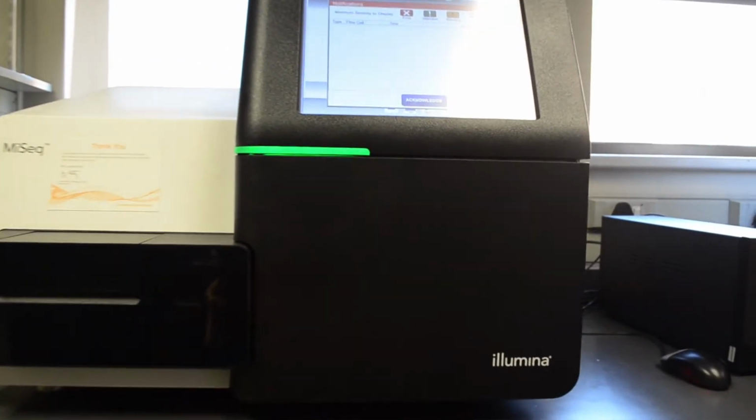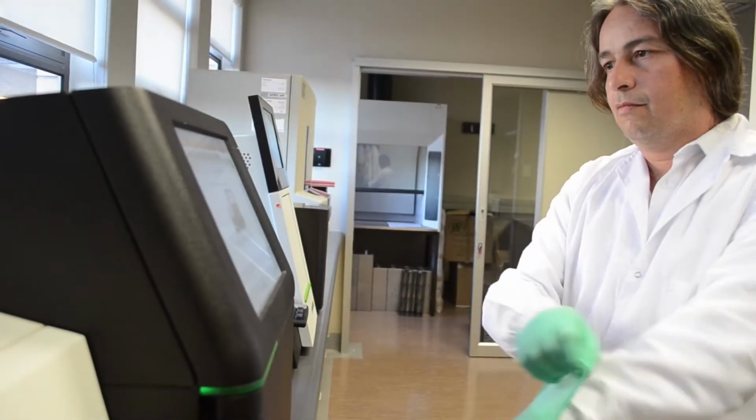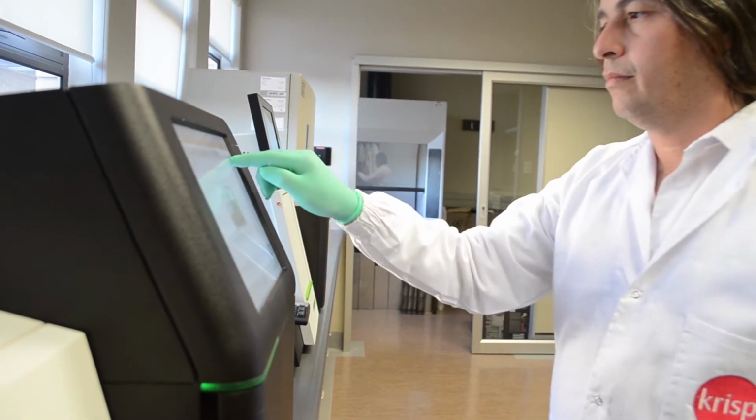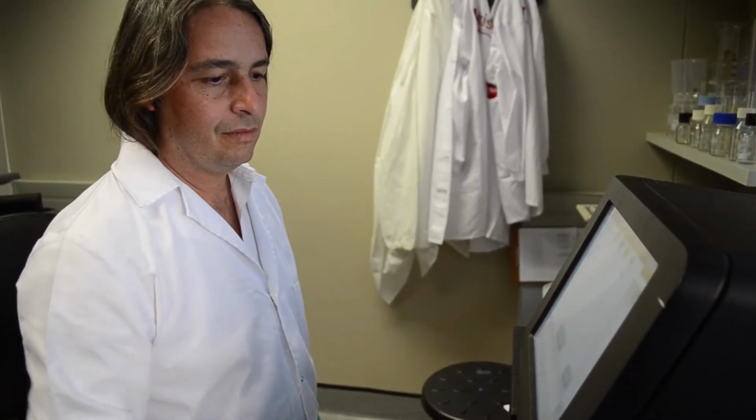Sequencing platform that we are very experienced with, and we are very excited to have hosted it for a number of years. It's the Illumina sequencing platform, and that is a very high throughput sequencing platform that we use to generate whole genome sequences of viruses and bacteria.